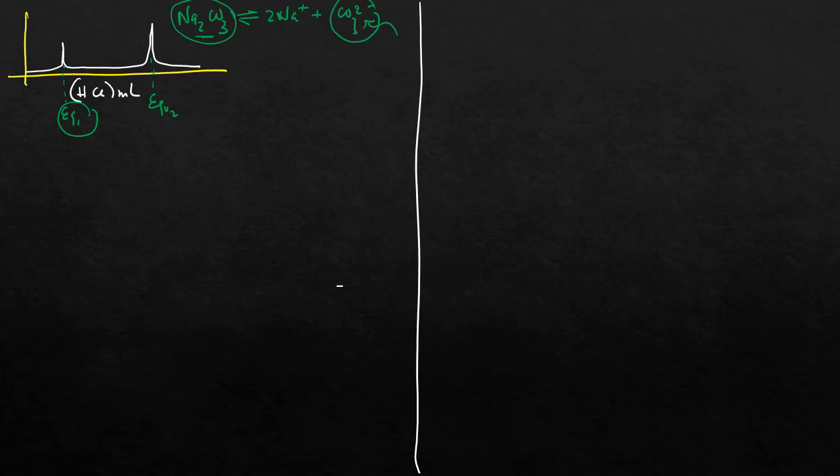So let's begin our calculation by first calculating the moles of our acid at each equivalent point. So the moles of HCl. So mole of HCl at first equivalent point. So that is going to be the volume of HCl at the first equivalent point, which is here. This is in mL. You have to convert to liters. So in 1 liter, we have what? 1,000 mL.